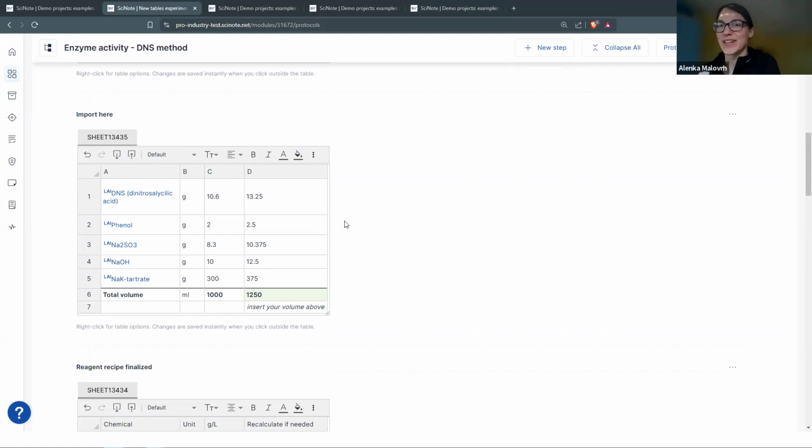And we will double check on that and see if we can actually fix it by the next week when we update this. And since we're on this topic, I actually forgot to mention in the beginning when I did my introduction. As you see, going forward, we will probably be introducing some new features or improving the existing features of the tables throughout the year.